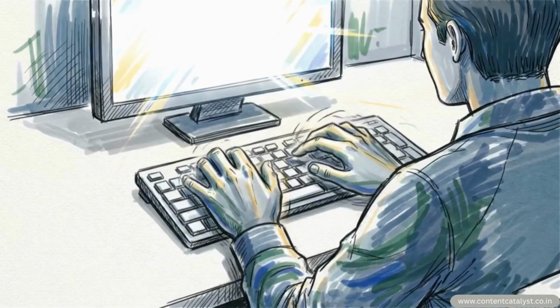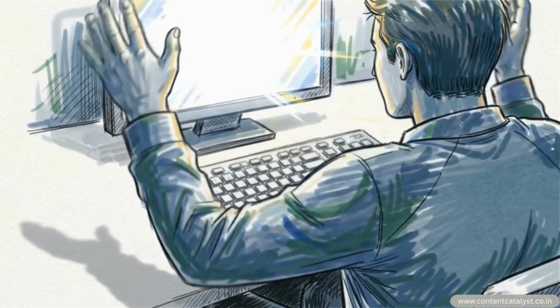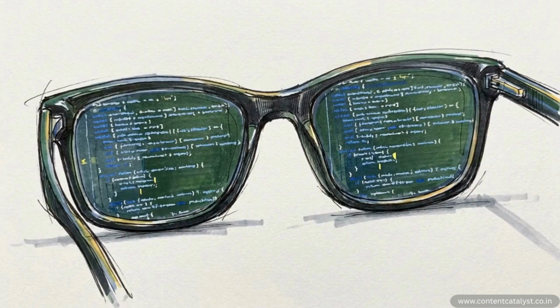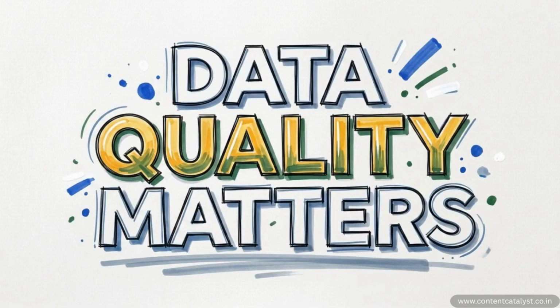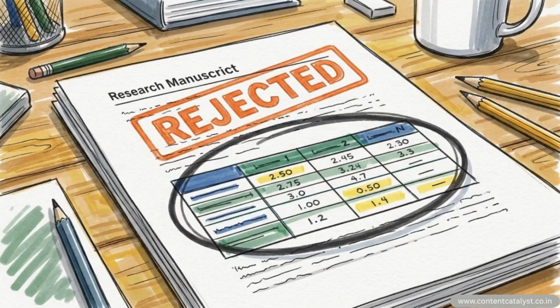Software superiority is a myth. The context of your research dictates whether a tool will act as an accelerator or a roadblock. There is one notable exception. If you are a life scientist who already knows how to code in R or Python, and your lab has no software budget, a Prism subscription is an unnecessary expense. Stick with your code. But regardless of your discipline, keep this in mind. No software can fix flawed data. Whether you are using a free script or a costly license, you must properly clean and organize your data before you begin. If you skip that step, your results will be inaccurate.